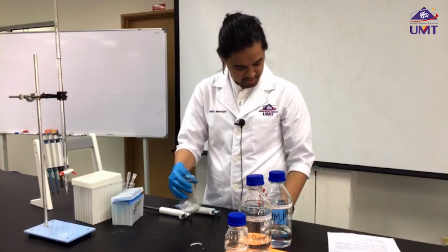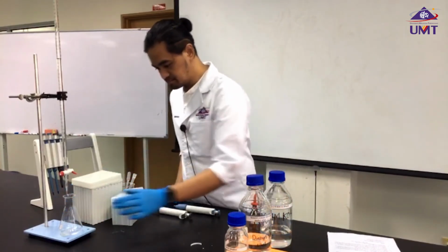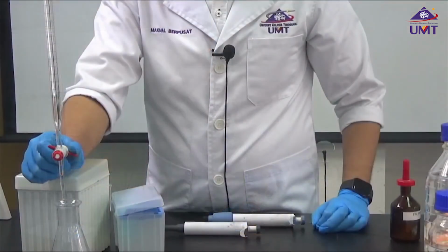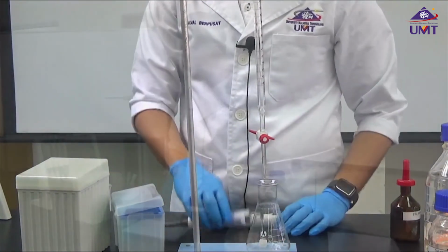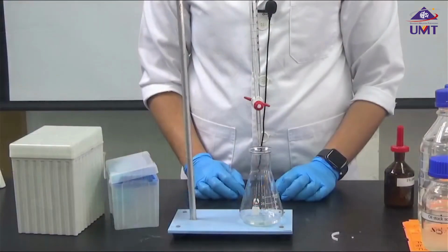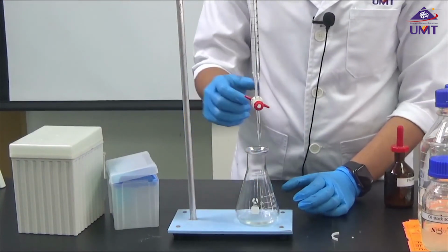So now we need to titrate our potassium hydroxide into our mixture, and we need to notice the formation of pink color.